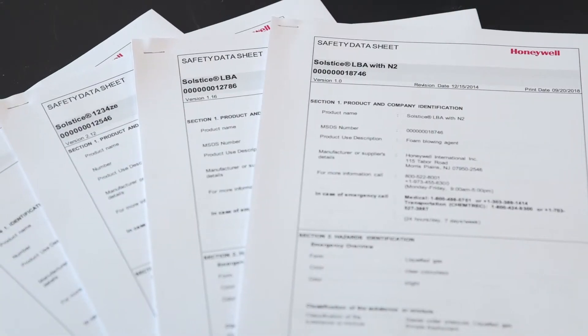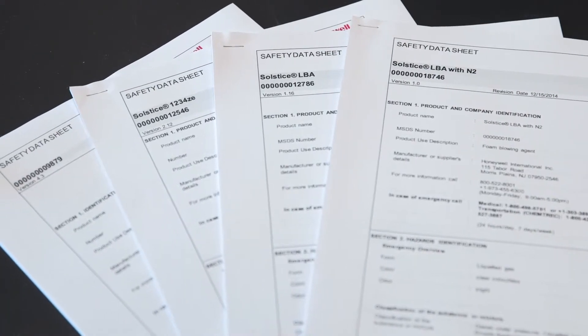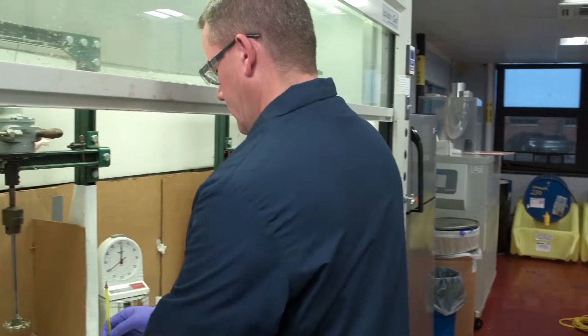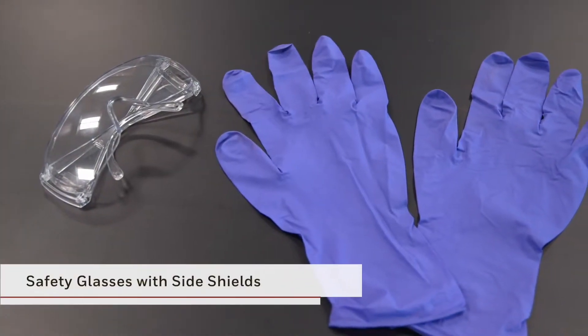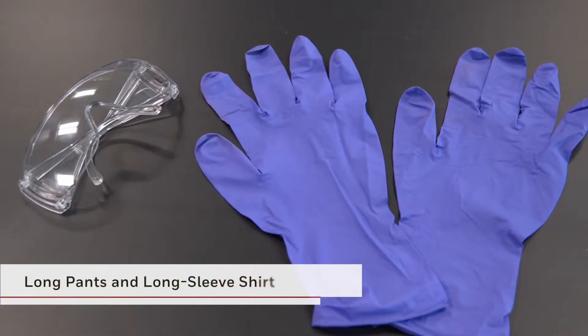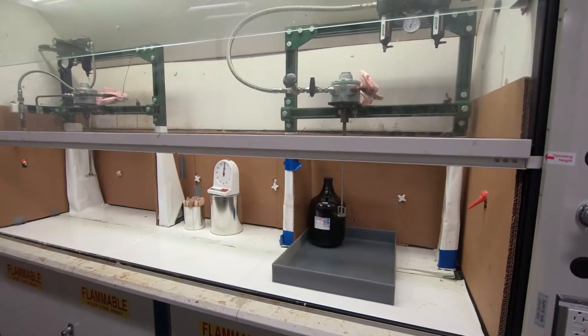Before getting started, it is important to review the safety data sheets for the materials that you will be mixing. It is essential to wear the proper personal protective equipment, or PPE. This includes, but is not limited to, safety glasses with side shields, solvent-resistant gloves, and appropriate clothing. The hand mix foam must be prepared in a hood with proper ventilation.